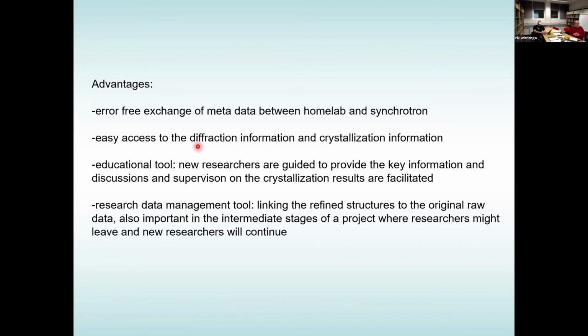So the advantages of this protocol are that there is an error-free exchange of metadata between homelab and synchrotron. There is an easy access to diffraction information as well as crystallization information. And I think it works as a good educational tool. At the university, all the time there are new people coming in, and the software asks the right questions, and if the researchers provide all the information, then this is available for discussions with the supervisor or later on for writing manuscripts. It's obviously also good for research data management, which is nice if you want to check back how a certain PDB entry was generated.